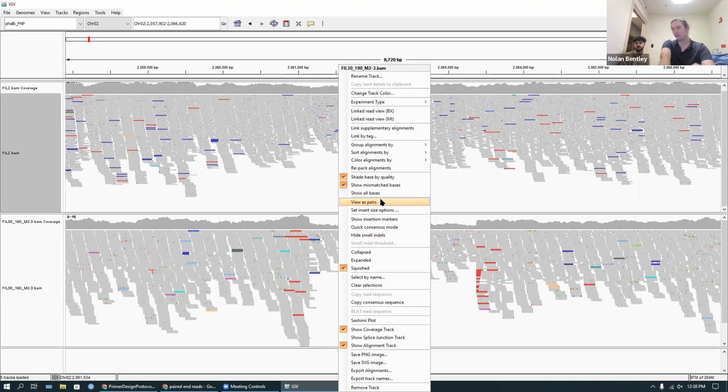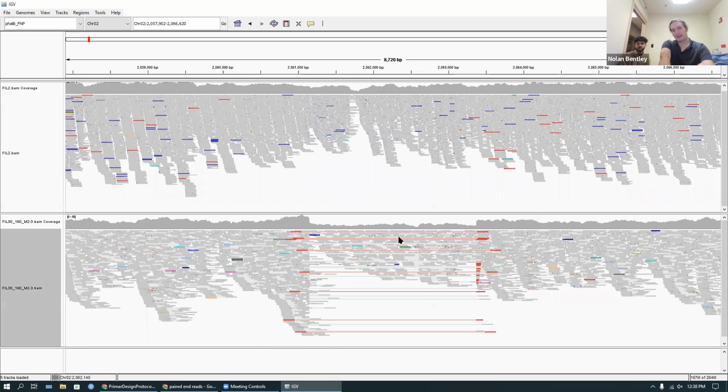And this is the real big trick for structural variants. At least it's really good for deletions. Because when I do that, all of a sudden, I see that those red marked sequences were marked red because they're linked across a deletion event.